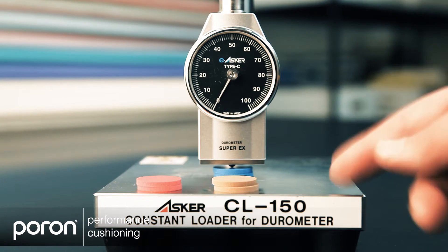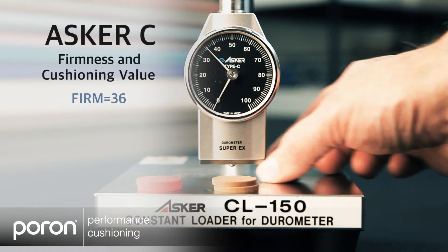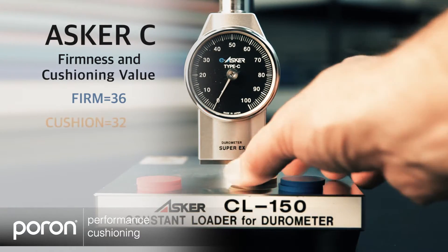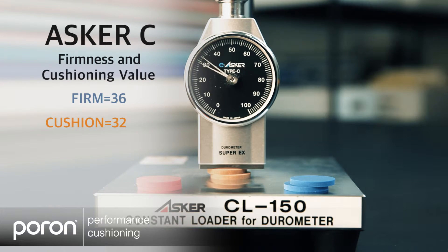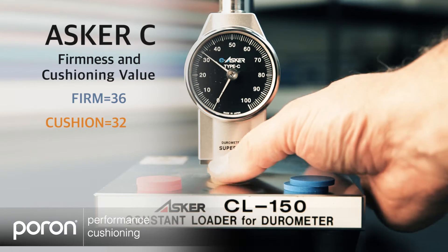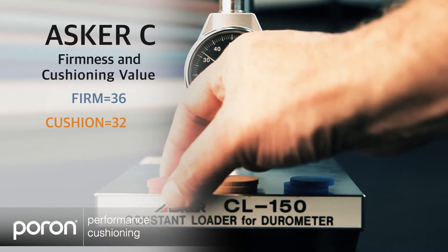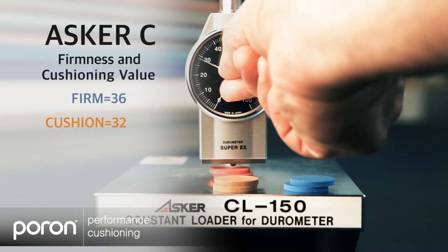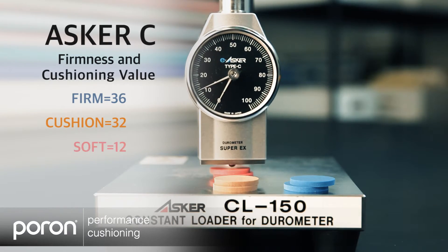We'll test the firm material first and it has an Asker C of about 35. Next we'll test the cushioning material, which is a little lower — about an Asker C of 30. And now the comfort foam, the slow recovery foam. It has an Asker C of about 10.